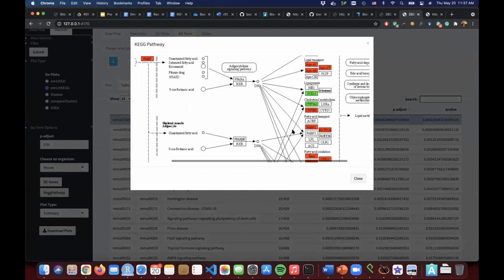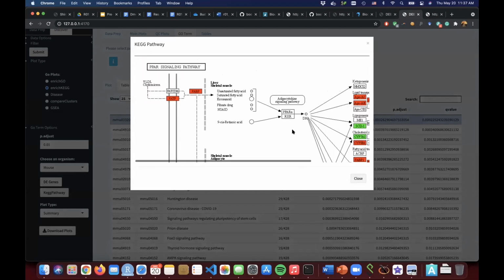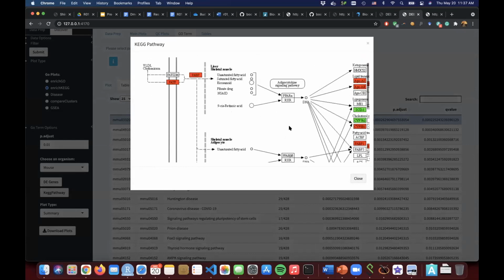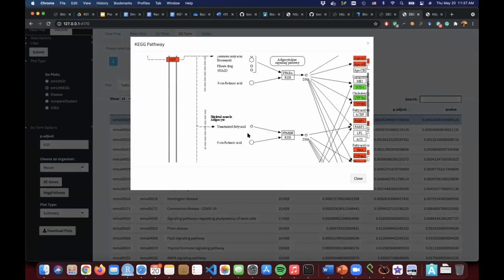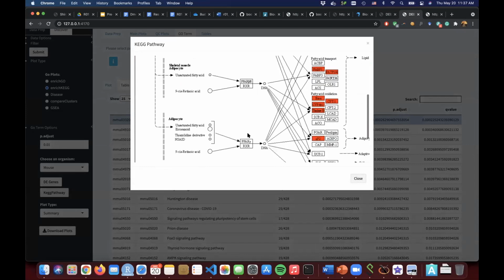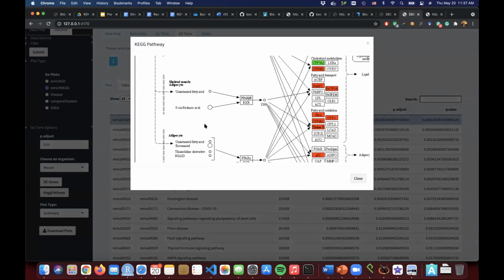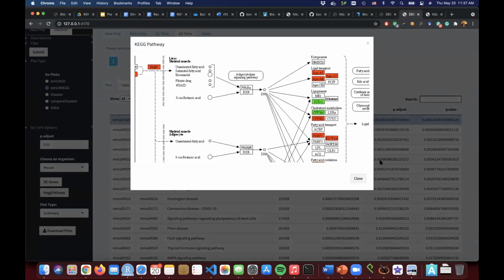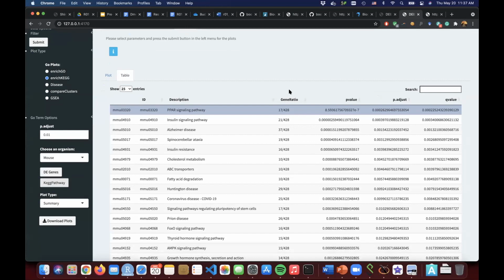You can actually use other programs like DAVID or FunRich, they do different kinds of analysis. I was comparing them, but this is using the packages in R. Sometimes it's not perfect, sometimes it's limited, but still, some of them are working like this. If it works, use it. But don't stop here when you're doing your GO term analysis. Go and use other third-party tools.